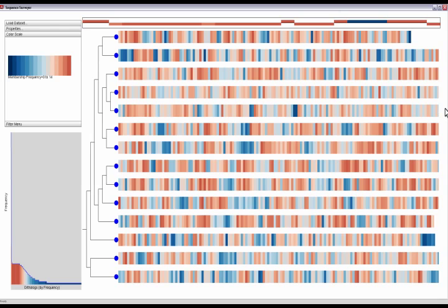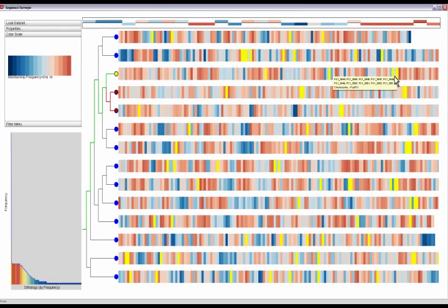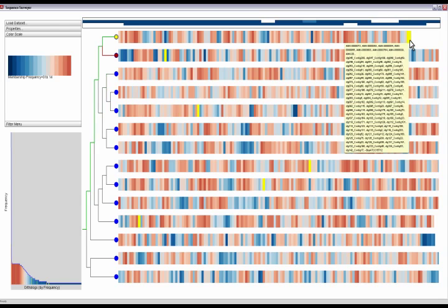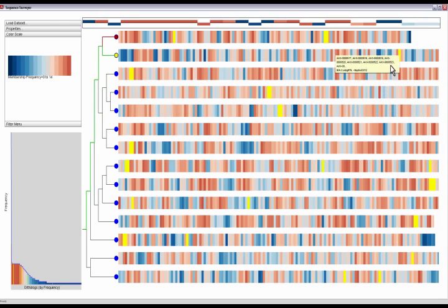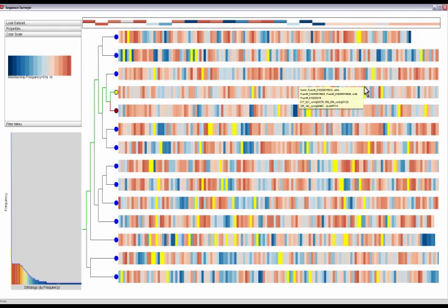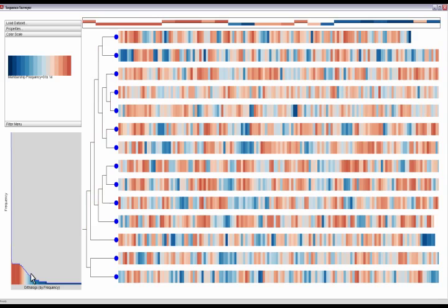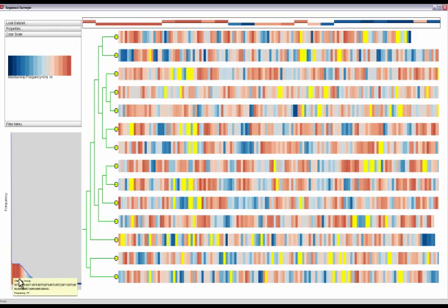Genes that occur in many genomes are colored red. Genes that occur in a single genome are colored blue. This coloring allows us to quickly identify core genes that are common and unique genes that may differentiate species.